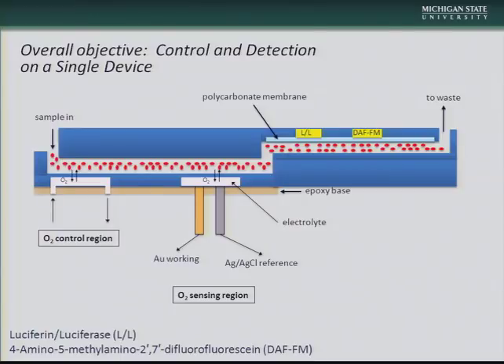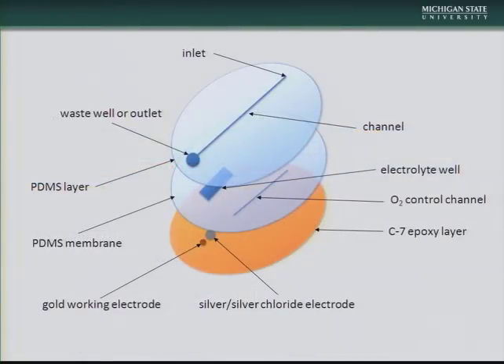And then after we know this oxygen tension, the red cells will flow up and we can measure the resultant release of the molecules from the cells. And so this is how we've been approaching this so far. And again, as I mentioned at the beginning of my talk, this is very preliminary work.